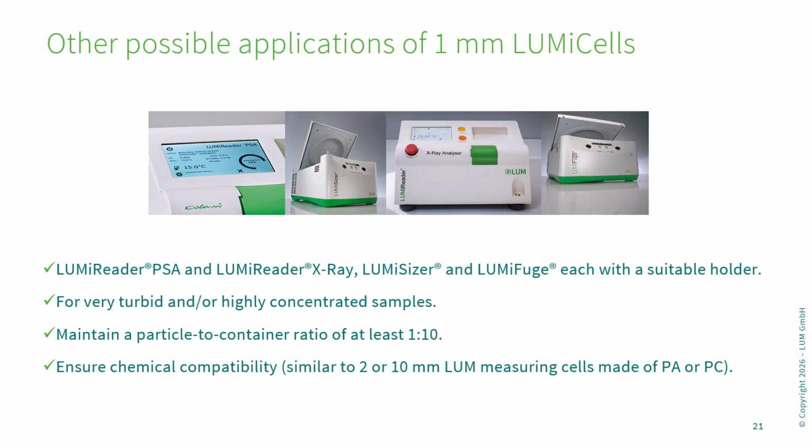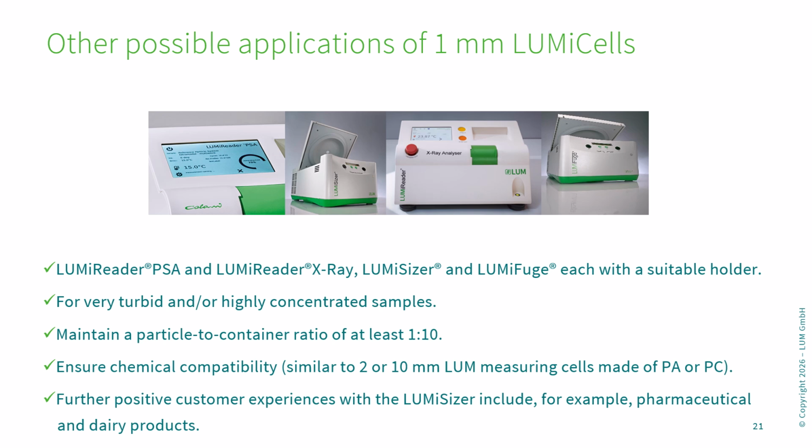We have very positive feedbacks from customers which experience 1 mm LUMiCells in the LUMiSizer on a regular daily basis, for example, to characterize pharmaceutical formulations or dairy products.